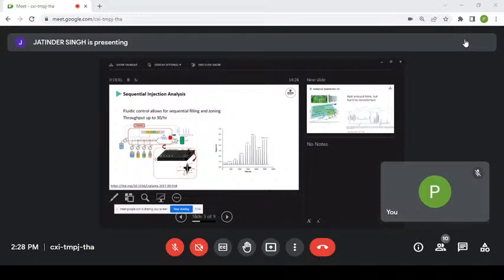And then we've got our LED-based detector that allows us to see an increase in intensity of color with an increase of our analyte. So it's an analytical technique that doesn't involve a separation, it's relatively simple. It is based on our analyte giving a particular color reaction when another reagent is present. It shows that by using some valves, we can control the direction of the fluids and the order with which they are injected into the microchannel.